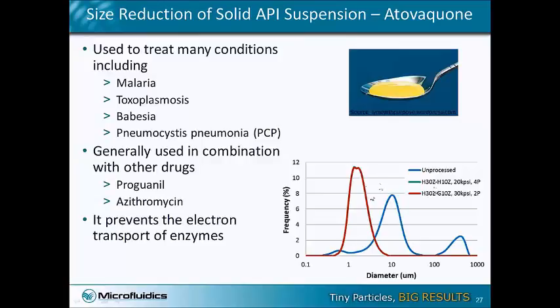One is from a process operated at the lower pressure, which means the lower shear, but with more number of passes. The other one is actually, you can see the two curves are overlaid on top of each other, which means we can adjust the process, for example, higher pressure, which gives a higher shear rate, but using only half of the number of passes.